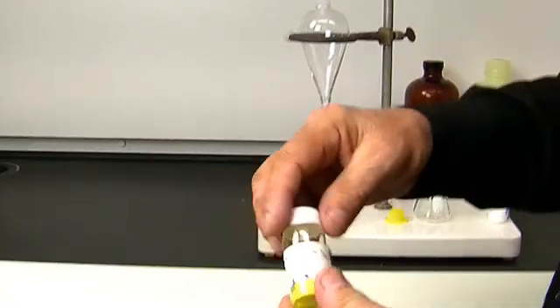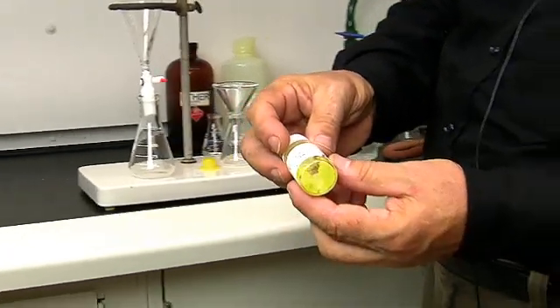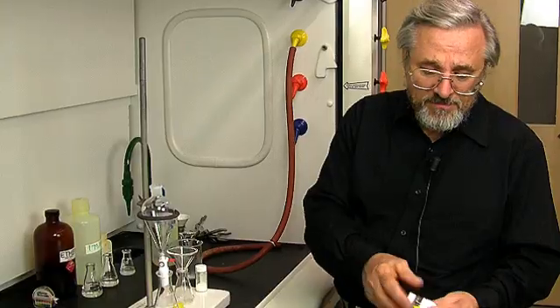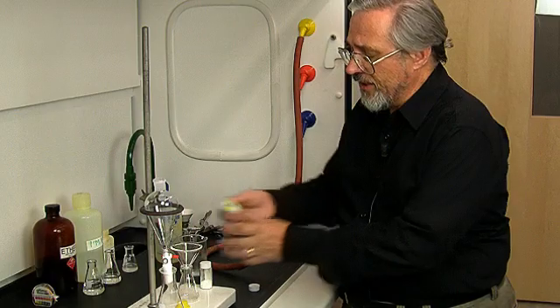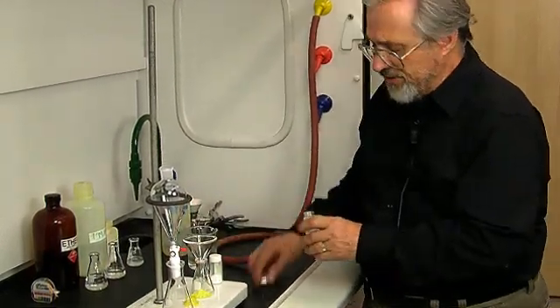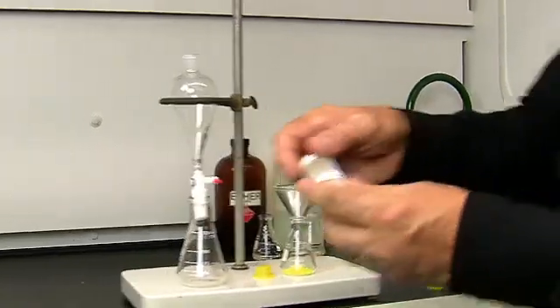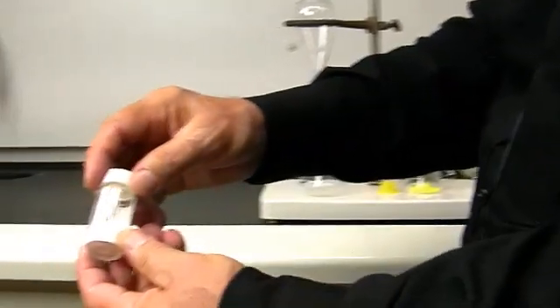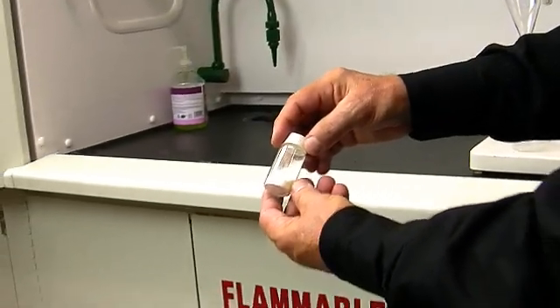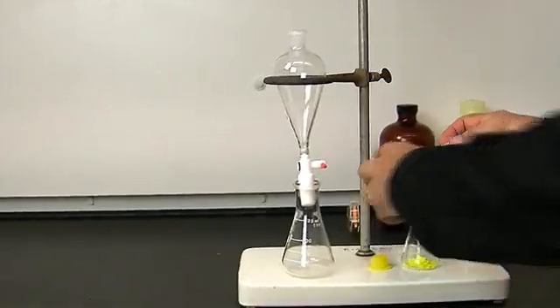So the first thing I'm going to do is to take fluorenone. You can see it's a nice crystalline yellow solid, and I'm going to put that into a flask. Then I'm going to take benzoic acid, which is a nice white solid, and I'm also going to put that into the same flask.